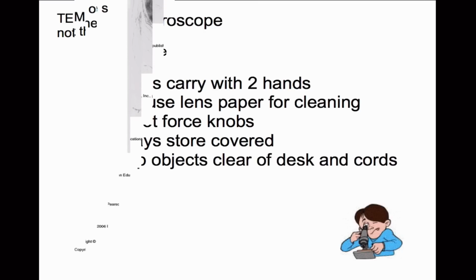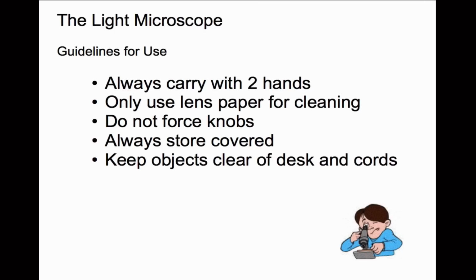This is what you're going to be using in class. I want you to always carry it with two hands. Generally, they'll be set up on the lab benches and you won't have to move it, but if yours isn't working and you need to trade it out, you might have to get a different one. So carry it with two hands.